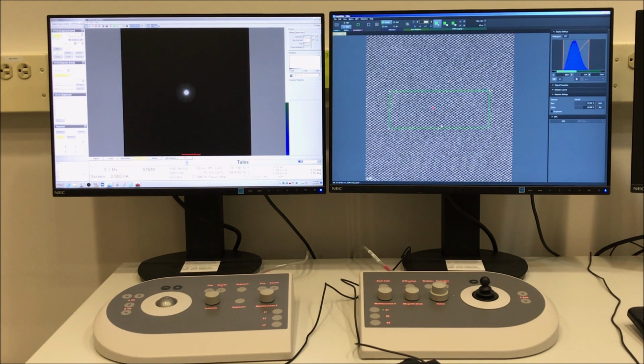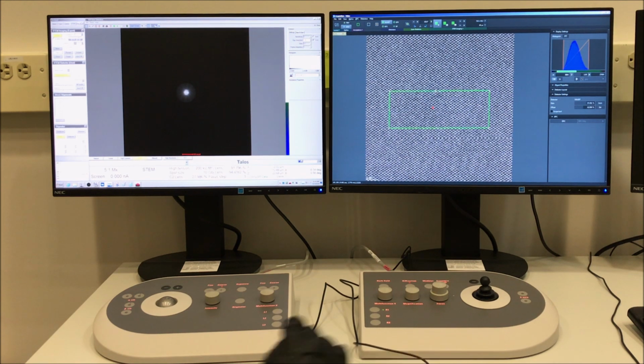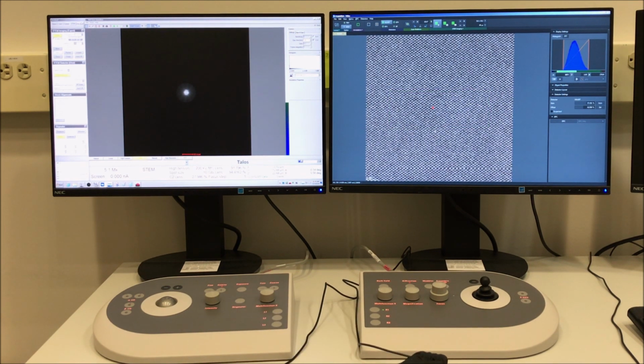And I basically have the scan rotation set pretty much perfect, so my dumbbells go left to right. And then once you're ready, just click on the annotation and then select delete to remove it.